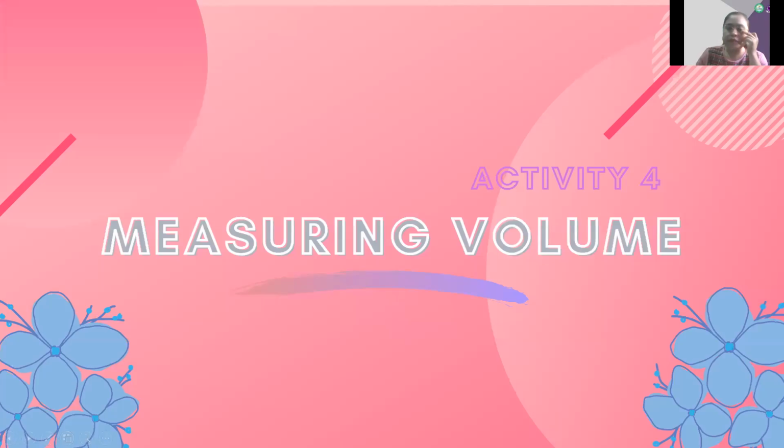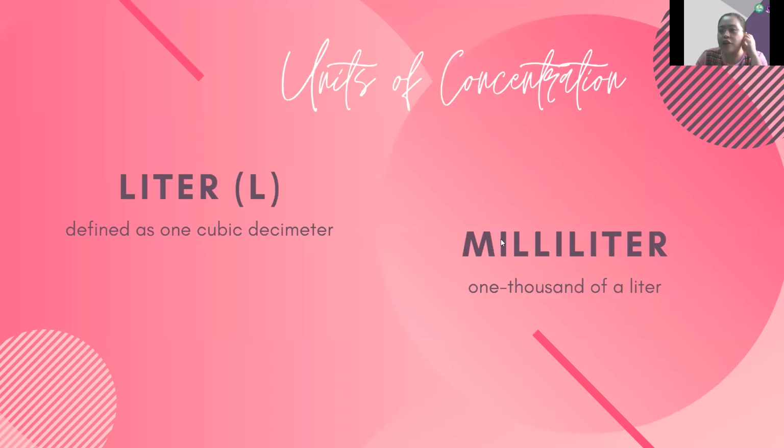Once again, Activity number 4 is entitled Measuring Volume. We are done with the mass, and we only have the analytical balance for our mass determination. This time for measuring volume, marami tayong pwedeng gamitin for the measurement. So we have here units of concentration first.